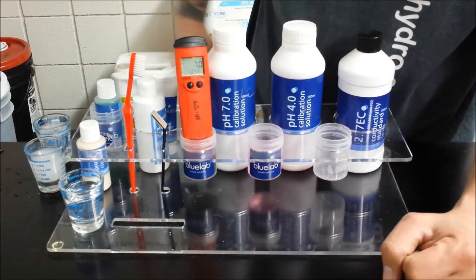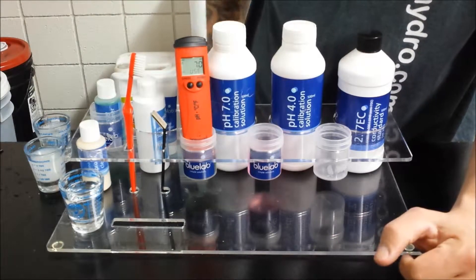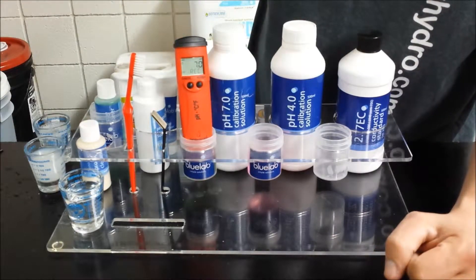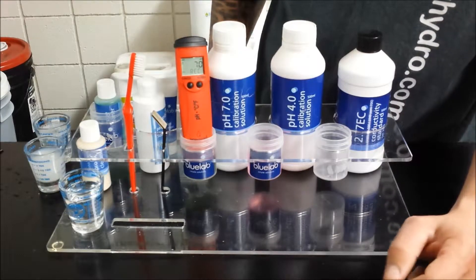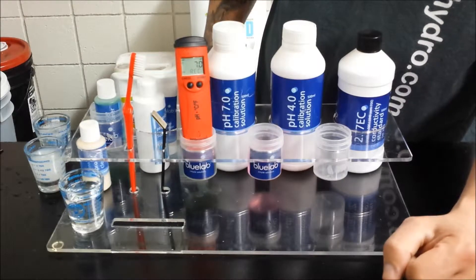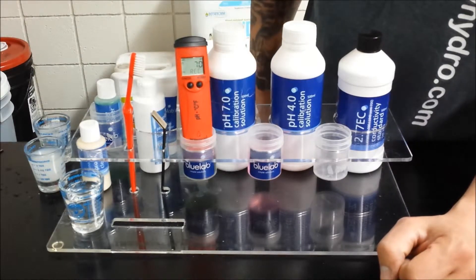Release the button. It says now use 7.0. Then it's going to say REC or record 7.0 so you know it's calibrating. Then you're going to want to watch the screen and it's going to tell you when to use the 4.0.